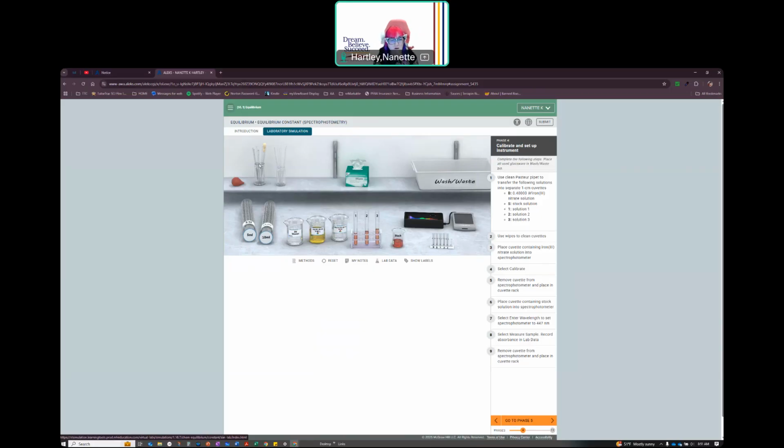Okay, so test your pipette. I'm going to take my blank and put it in this one. Get rid of that. Take my stock down. Take my solution 1. Put it in that one.